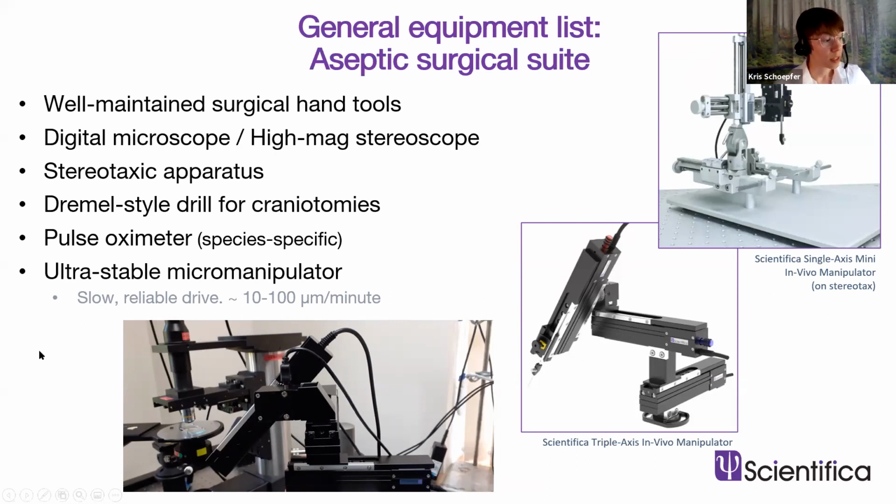And then of course, you will definitely need an ultra stable micromanipulator, something to drive the probe into the brain to your target.